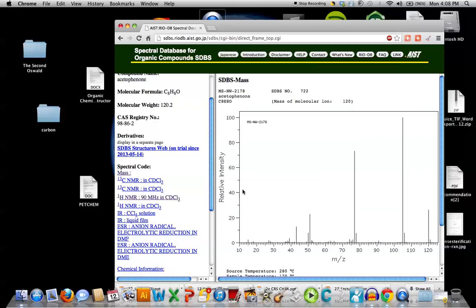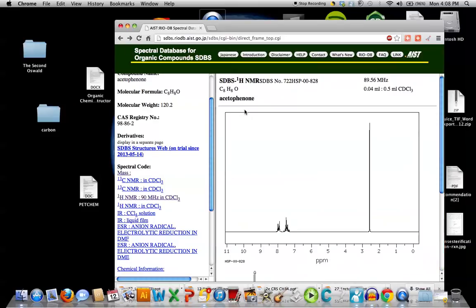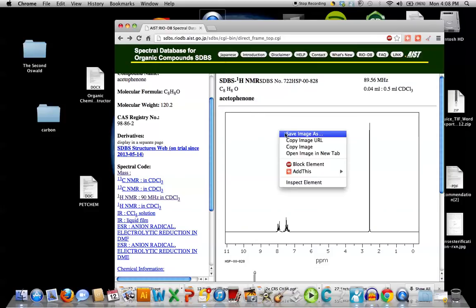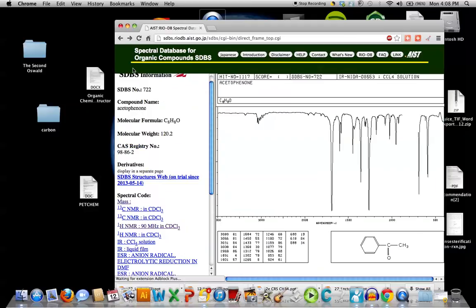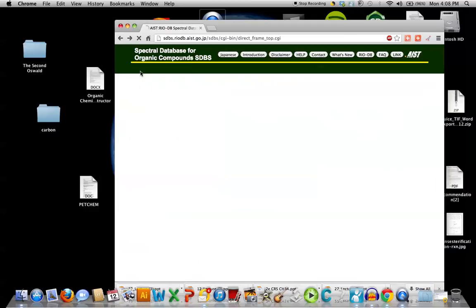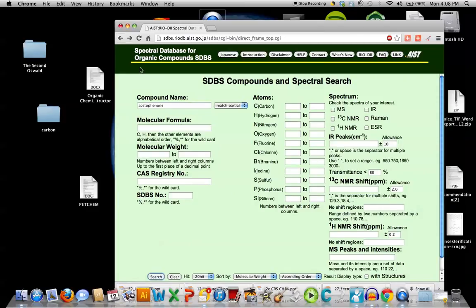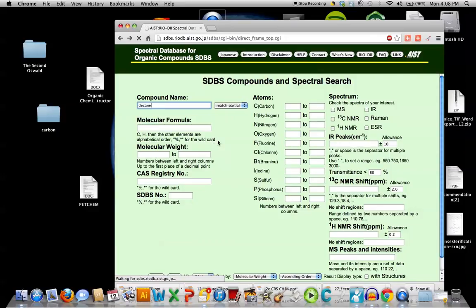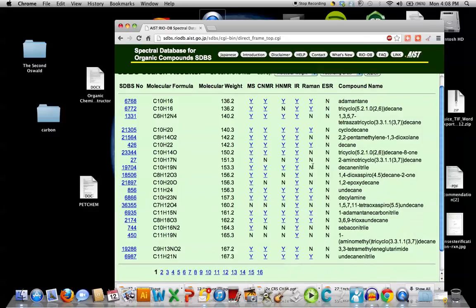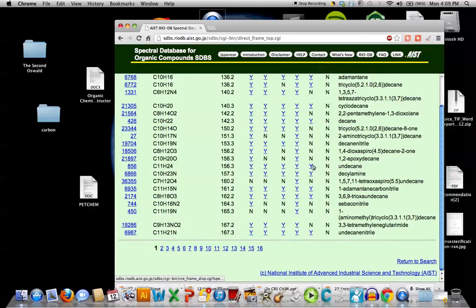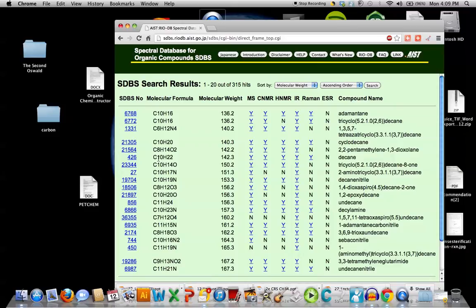Let's take a look at one other example. Let's type in decane and see what we find. So we'll go back. And let me put in decane. Must be a lot of people accessing the database. A little slow today.